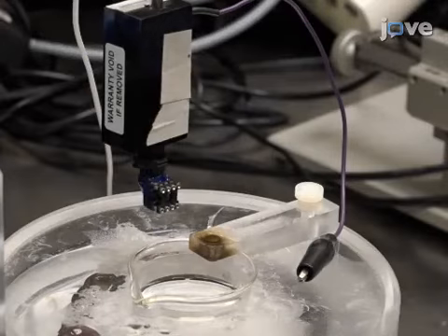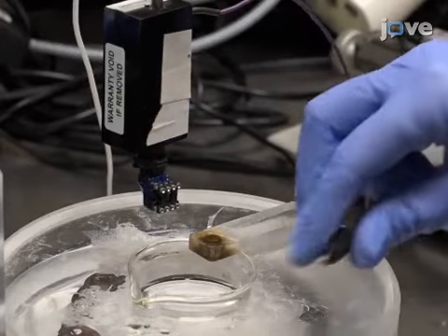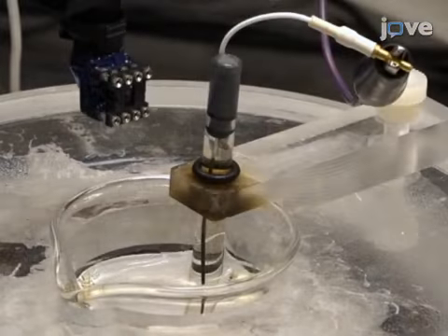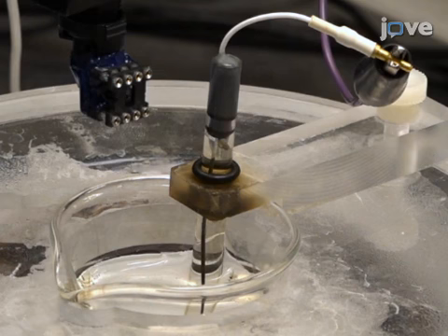Now, place the reference electrode through the opening in the plastic arm. Lower the reference electrode into a beaker containing PBS and ensure that it does not contact the bottom of the beaker. Next, connect the reference electrode.